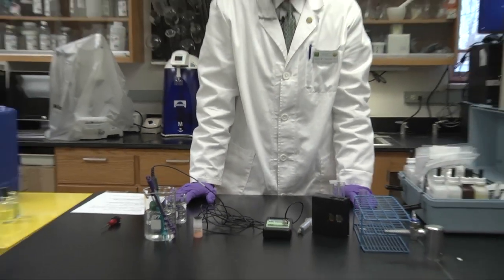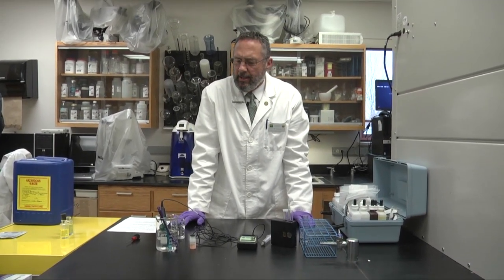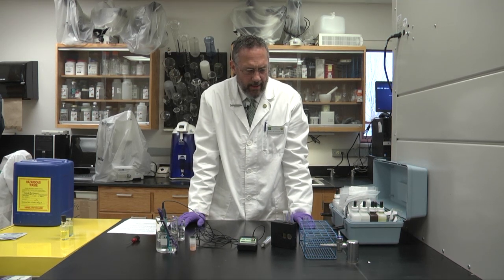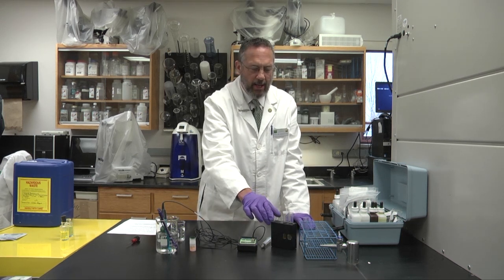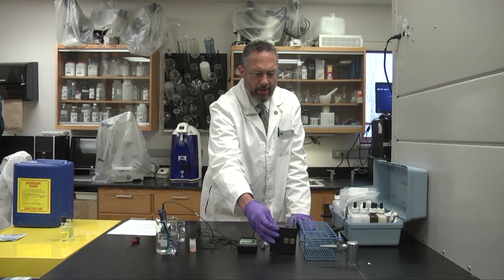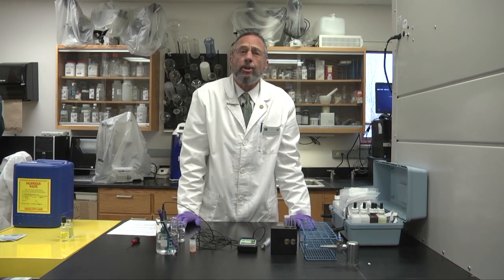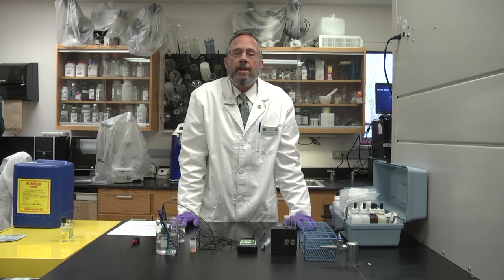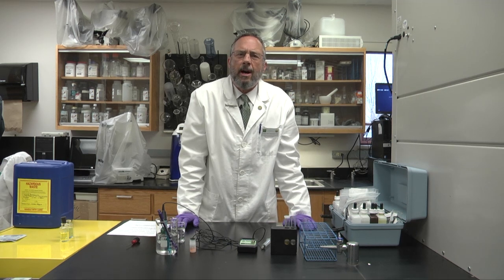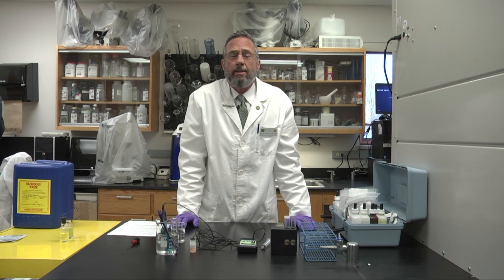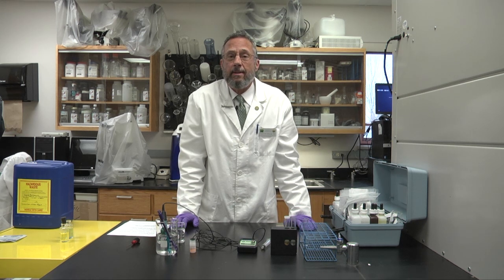So we simply use the table and we find the number that corresponds to the temperature of 18 degrees C and a pH of 7.8. And then we take the number that we got from this color wheel, 1.2 parts per million total ammonia, multiply it by that number from that table and that gets us the milligrams per liter or parts per million of toxic or unionized ammonia. Toxic or unionized ammonia of 0.4 parts per million or higher can give fish a problem. It can kill fish or it can cause them to not eat as much and grow less and it reduces survivability.